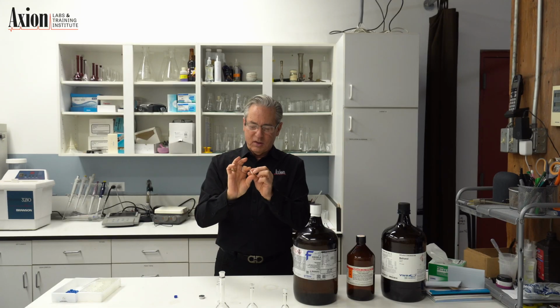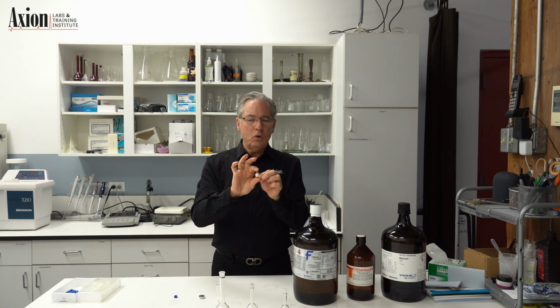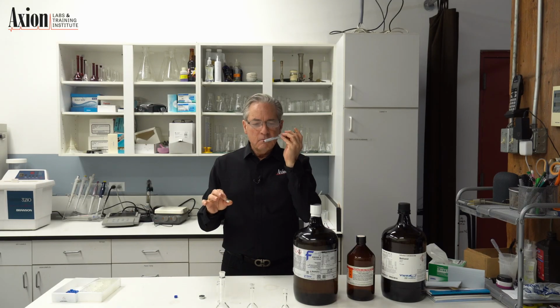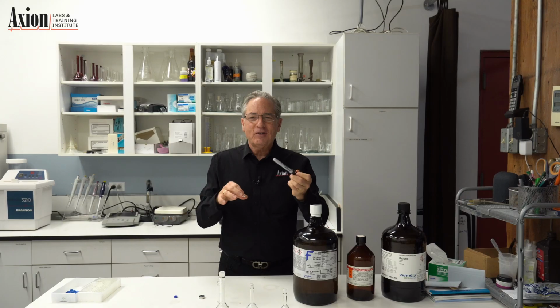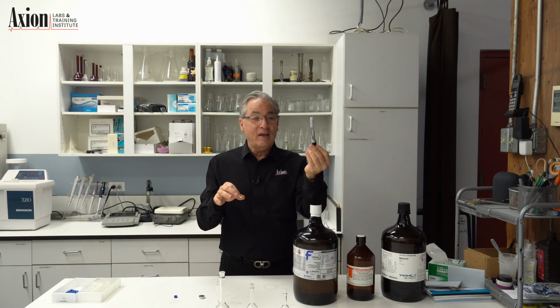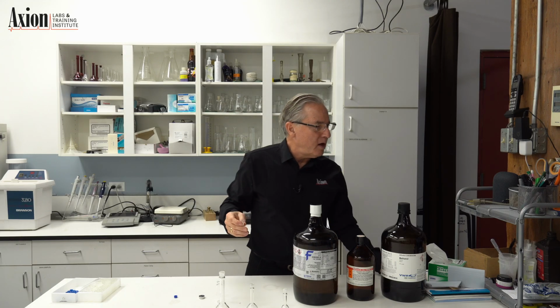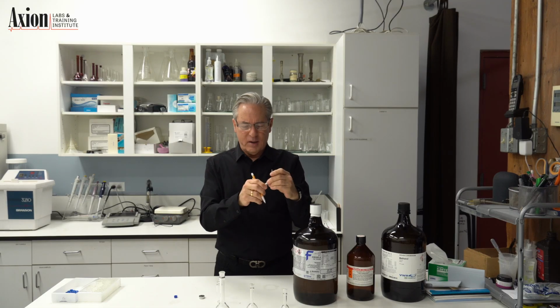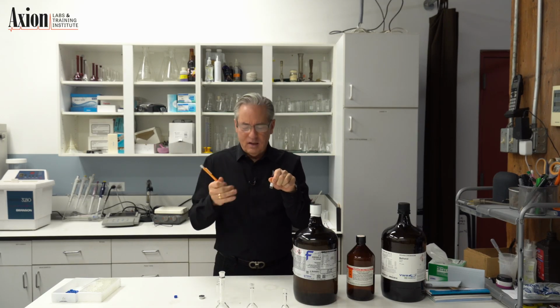I like the ones with the little white markings on them because I write with pencil on my vials. I do not use markers. Sitting around here, of course, we all love our Sharpie markers, but the Sharpie marker, I can smell it. Well, if you can smell it, the GC can detect it. So I personally don't like using these around my samples because we are talking about a very sensitive technique. Those vapors can get into the sample vial. That's why I prefer using pencils or wax pencils. That way I can write on the vial and not worry about any volatiles.